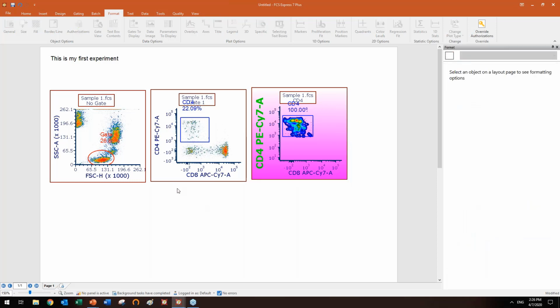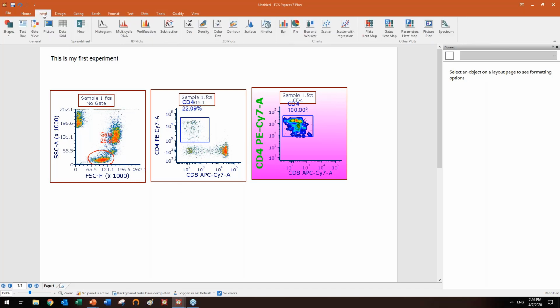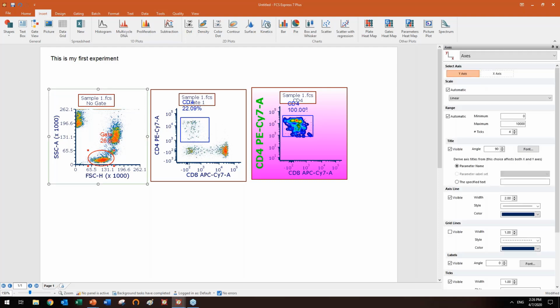So let's say that this is your analysis. You will see you can do much more. I just want to mention, but we will see in a few minutes, you can also add charts here. You can add a heat map. But anyway, if this is your analysis, you can use FCS Express to present your data, with the advantage that if your boss asks you, what if I move this gate here? How does this affect all my other plots? Well, that's easy. It's already done.